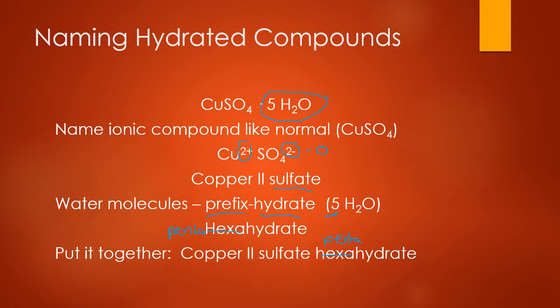All right, so I have named one for you on number 5 of your pre-lab. The other one you have to name is the sodium sulfate compound with the 10 water molecules. Don't make the same mistake I did and get the correct prefix for 10.